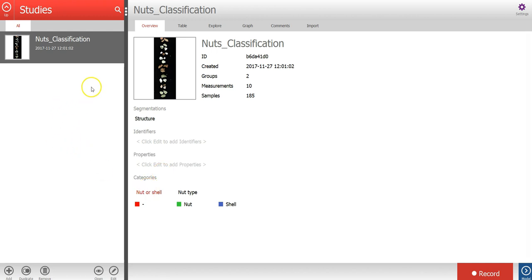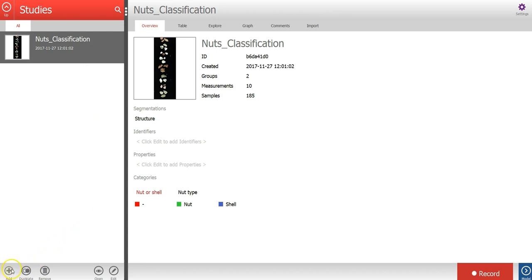As you can see we already have a study here called Nuts Classification. To add a new study I will press the add button in the lower left corner. Here you can select to add a new empty study, perhaps if you are going to record new images from a camera.